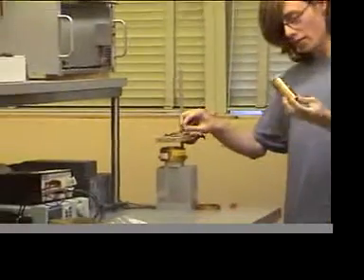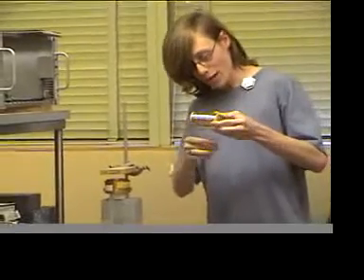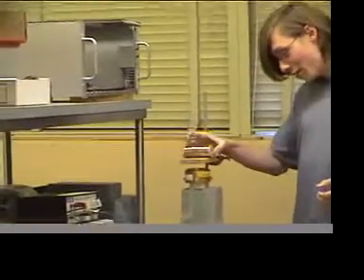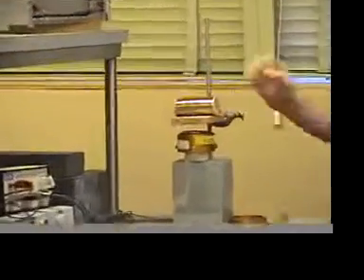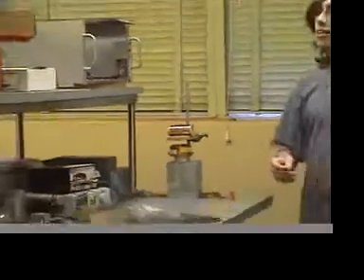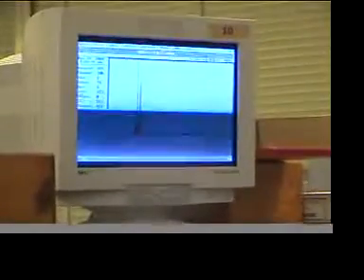So in this case, for example, we have a gold thread, which I bought off the Home Shopping Network, and is supposedly painted with real gold to get its color. Let's find out. So I've just placed the thread above the source, and then we tell our computer to start counting. And then after some time, we see what peaks show up. Now in the gold thread's case, it turns out that it had 2 peaks which corresponded exactly to that of copper. I wasted a lot of money.